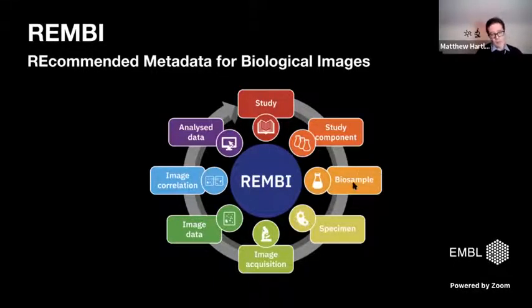So metadata, for example, associated with the sample. What is the thing you are imaging, the specimen, how you've prepared it, how you capture it, what the data is, and so on. Quite a lot of what we're working on at the moment, and will be working on over the next few months, is implementing REMBI as the metadata standard for the BioImage Archive, and that will also expand to the other resources.